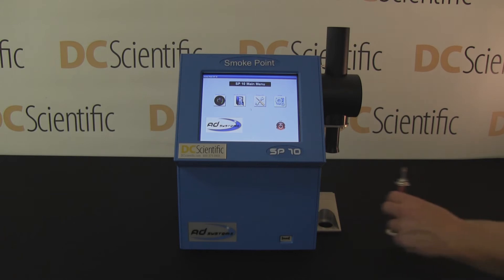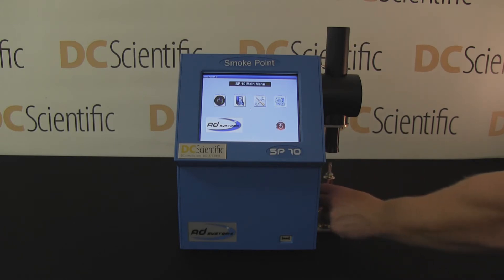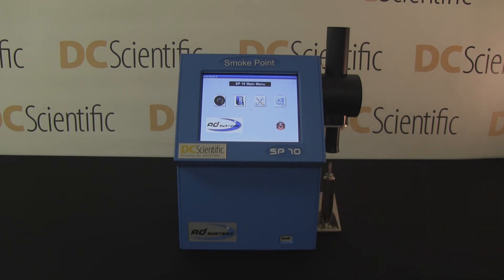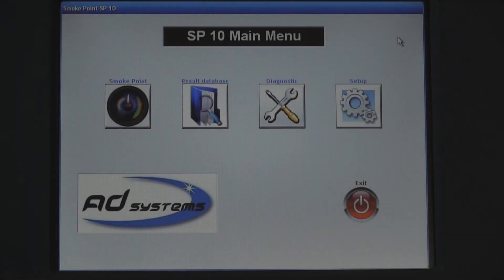The test begins by placing the sample onto the sample conveyor. Using the touch screen, select the smoke point icon.